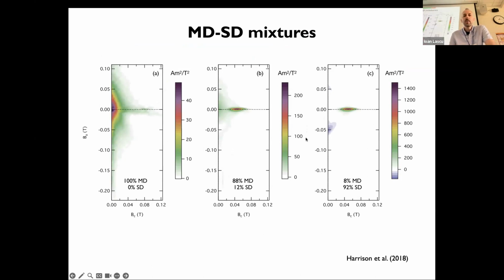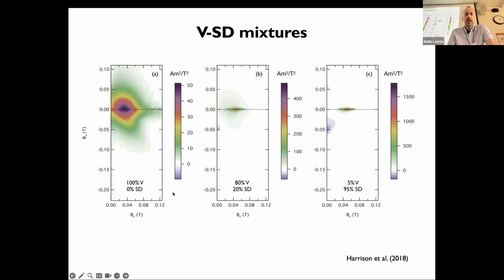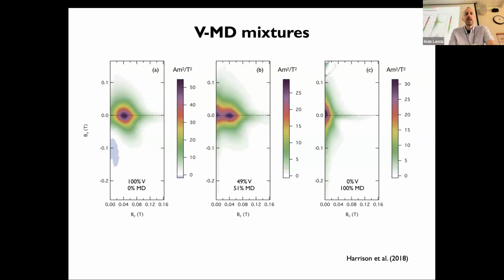The single-domain one was an MV1 culture, so magnetofossils or magnetosomes, magnetotactic bacteria products. We had a mixture of SD and a PSD sample, mostly characterized by multi-vortex particles, 1 to 3 microns in size, and then a vortex MD series of mixtures.